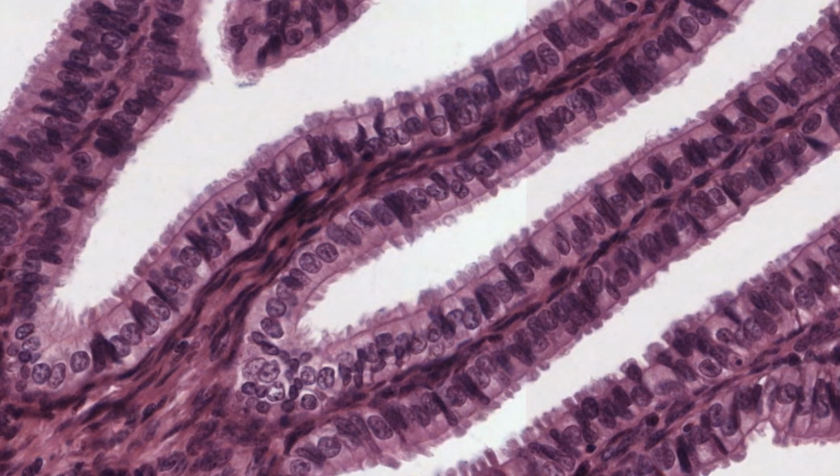Here is another example of a simple columnar epithelium with another type of surface specialization. These are cilia lining the uterine tube. The shape of the nucleus generally reflects that of an epithelial cell, so the shrewd histologist infers the shape of the cells from that of their nuclei.